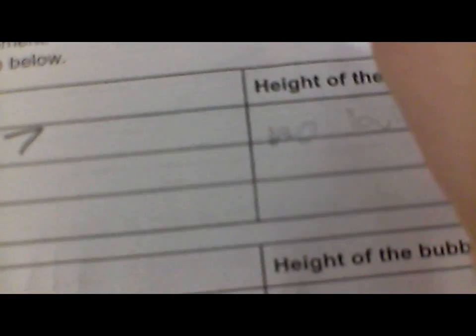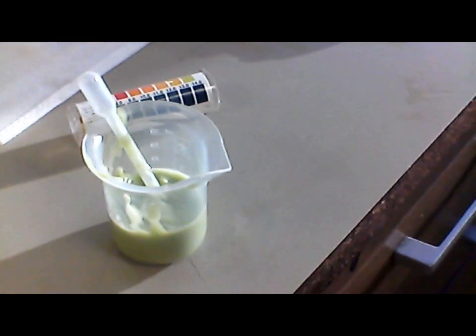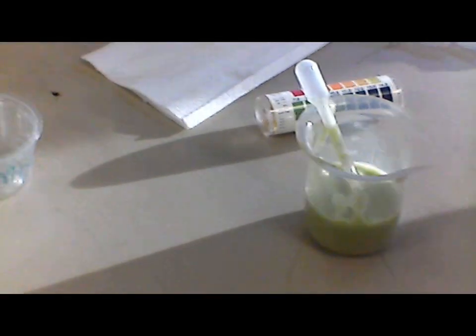So for the second test tube, I dump it out and put it in the mixing cup and then add the vinegar to it. That one's just hydrogen peroxide. Yep, that's the first one. Hydrogen peroxide alone. Alright.